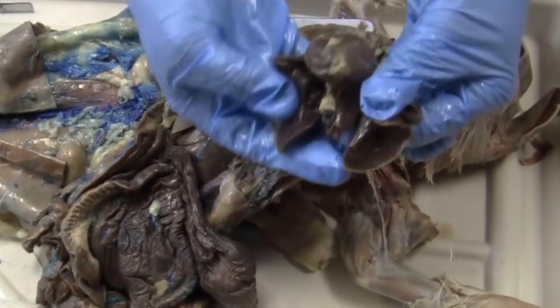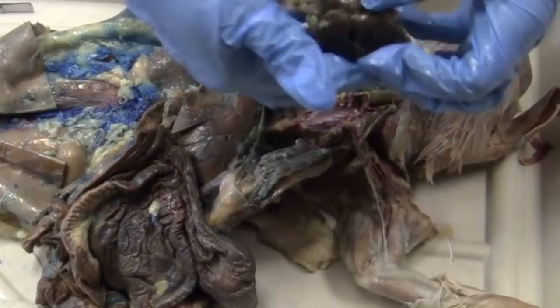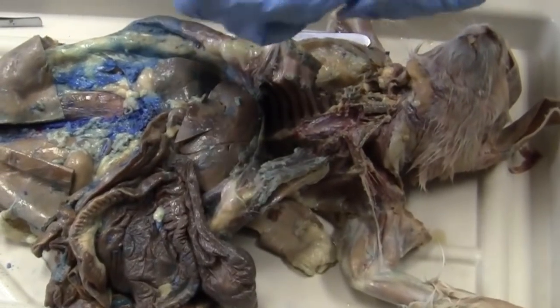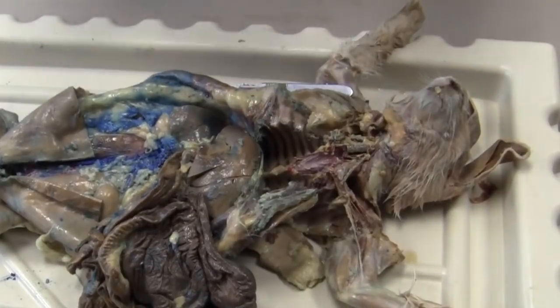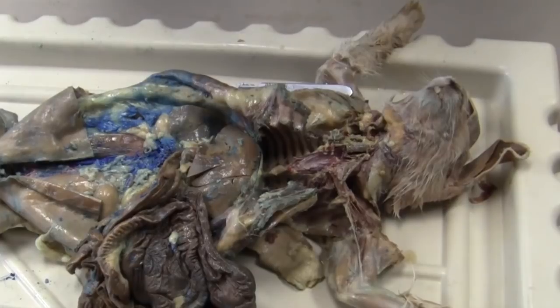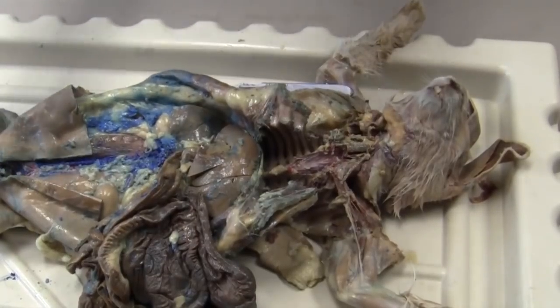Okay. So I have my heart cut out. And you should be able to go up and clean up more of this fat off. And I want to clean it up enough that I can identify which vein and artery is which.